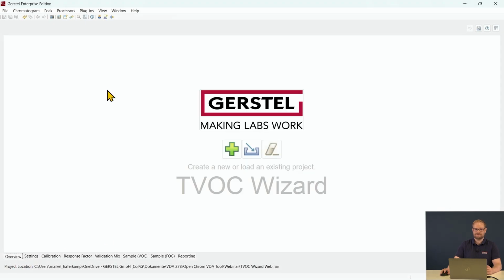The TVOC Wizard simplifies and automates your emission data analysis according to VDA 278. The report is fully compliant and therefore saves a lot of analyst time and so reduces cost per sample.